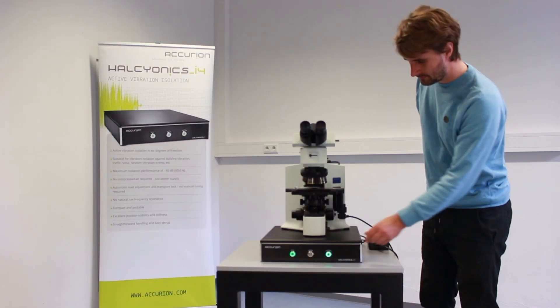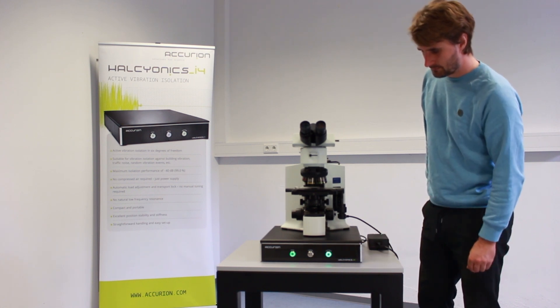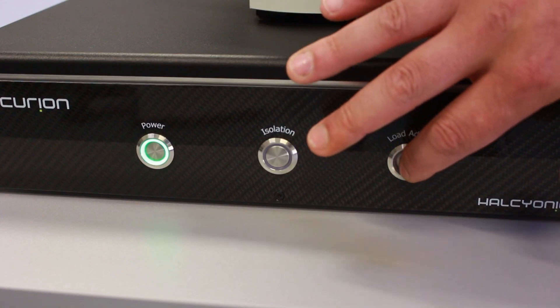Since even light touching could be detected as a changing load, we recommend turning off the load adjustment mechanism to avoid any sudden readjustment at a disadvantageous moment.